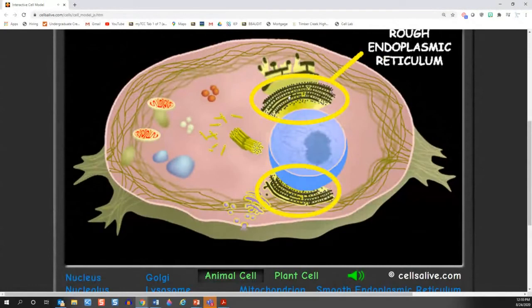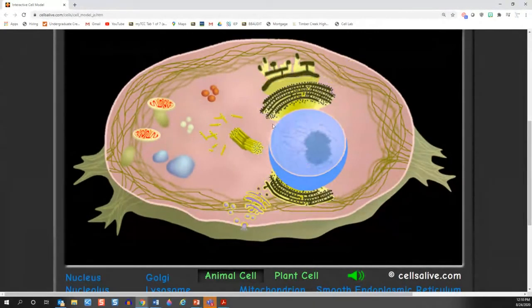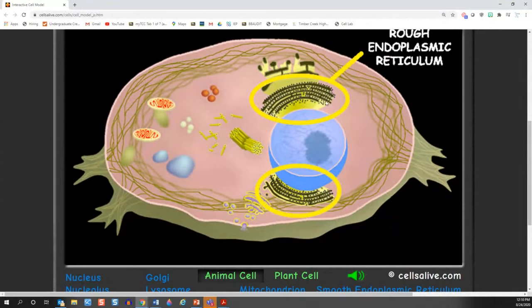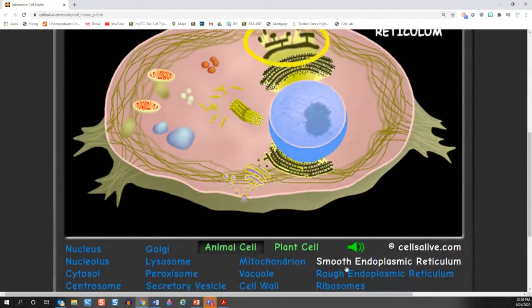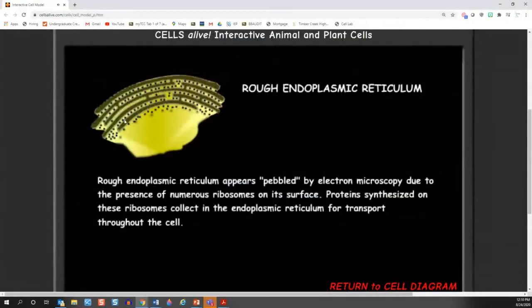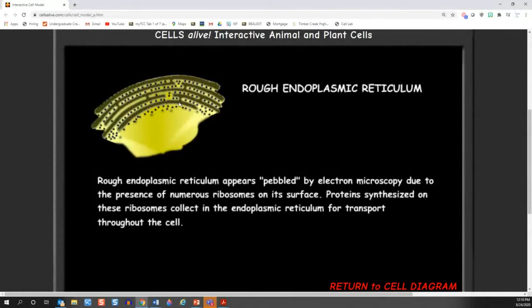Next to the nucleus, you see this kind of squiggly back-and-forth yellowy structure — that's called the endoplasmic reticulum. And these little dots all over it are the ribosomes. What did I tell you ribosomes do? They make protein. So based on the fact that ribosomes are stuck all over the ER, make a guess as to what the endoplasmic reticulum does. Basically, the proteins get made along these ribosomes and then they get squirted inside the endoplasmic reticulum for further processing — proteins have to fold and sometimes get modified.